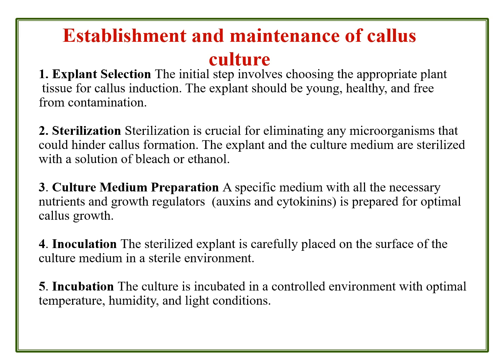In that way, once the media is prepared and sterilized, it is taken to the laminar airflow chamber where aseptic conditions already prevail. The media is always open to the face of the filter, that is a HEPA filter, a high efficiency particulate air filter in the laminar airflow chamber, where the inoculation, culturing and subculturing can be performed.